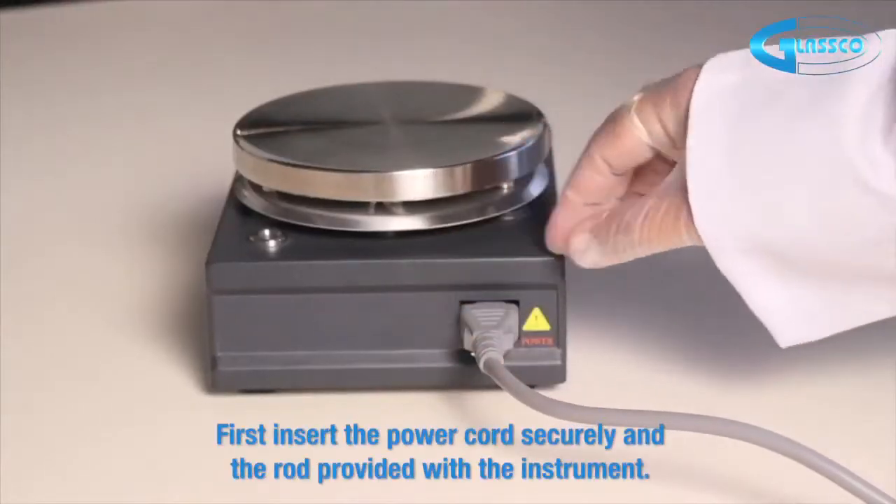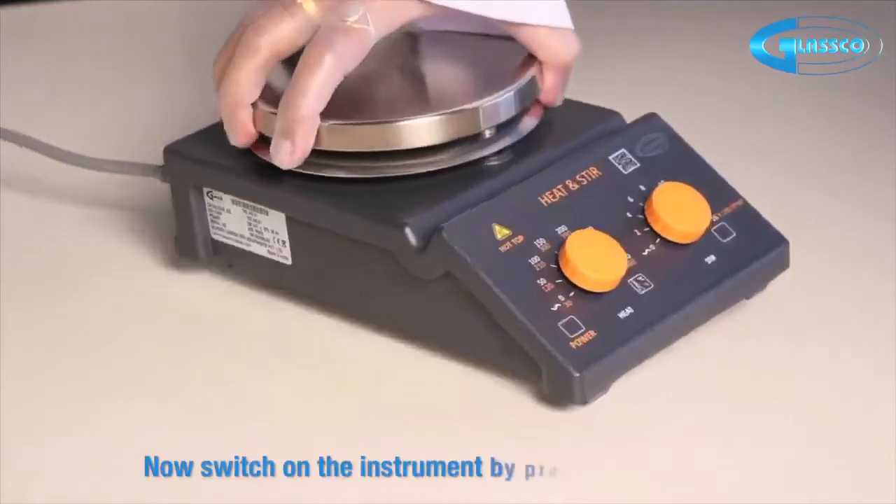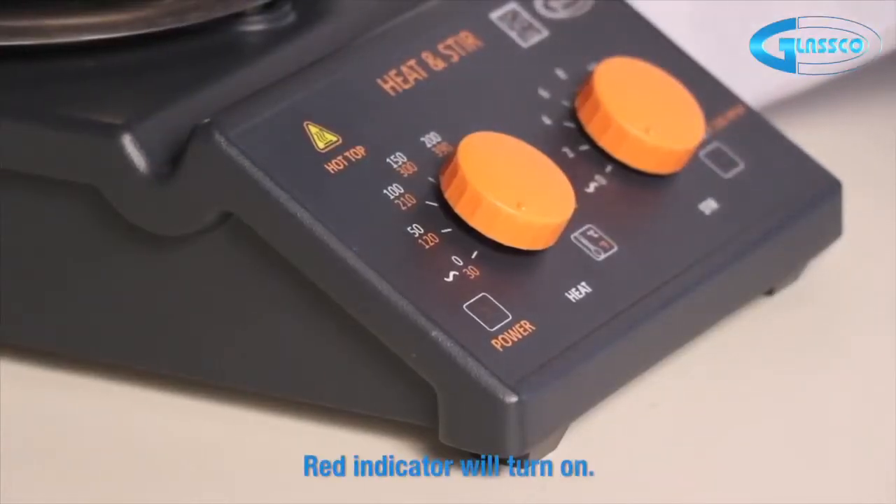First, insert the power cord securely in the slot provided with the instrument. Now switch on the instrument by pressing the on/off switch. The red indicator will turn on.